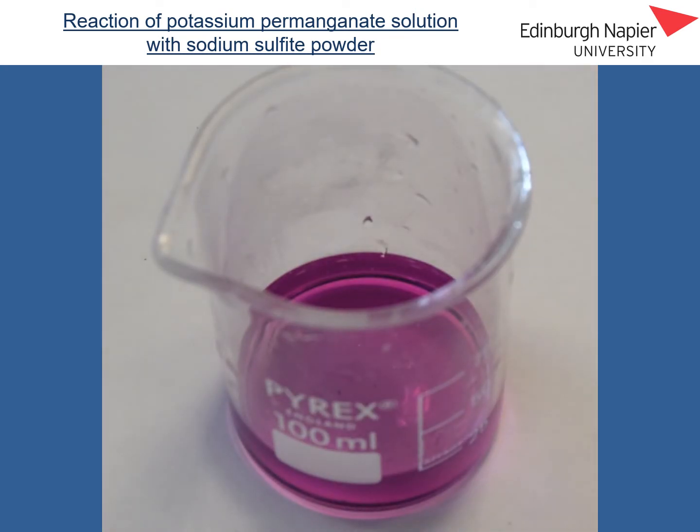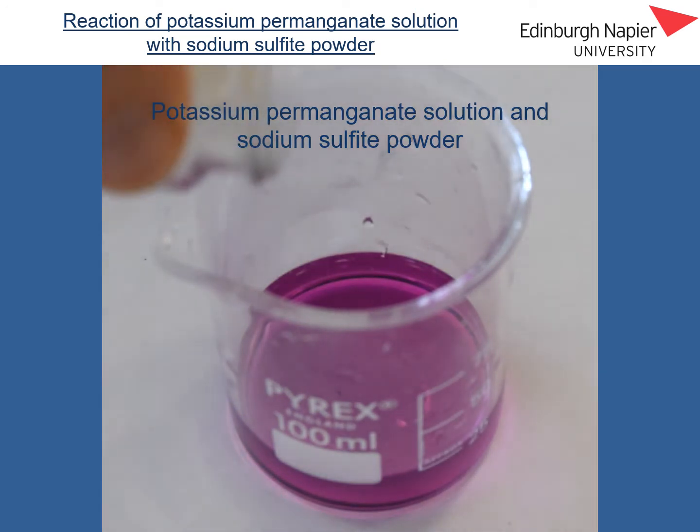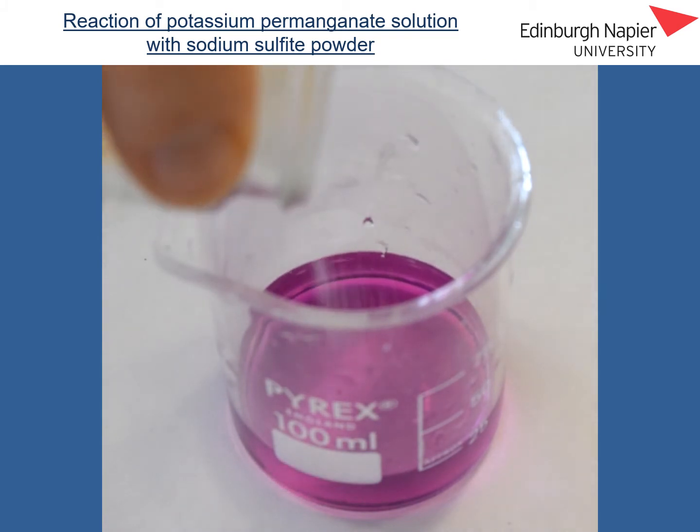In this experiment we have potassium permanganate solution, and you can see the purple colour of the permanganate ion there, and to that I'm going to add some sodium sulphite powder. So if I just add a little bit of sodium sulphite here, and we can observe what happens.